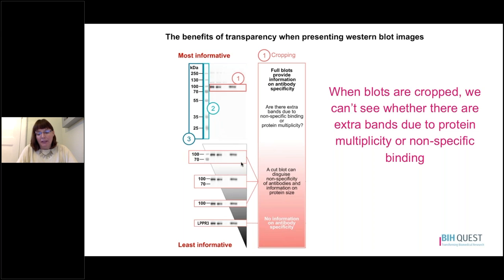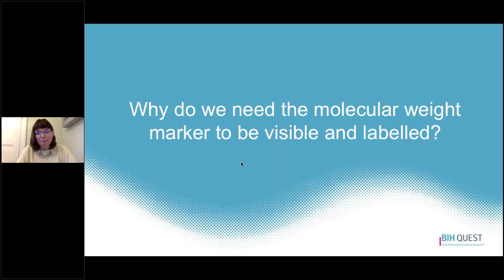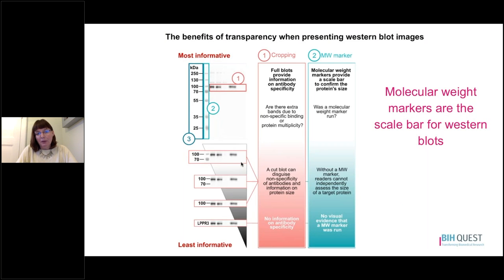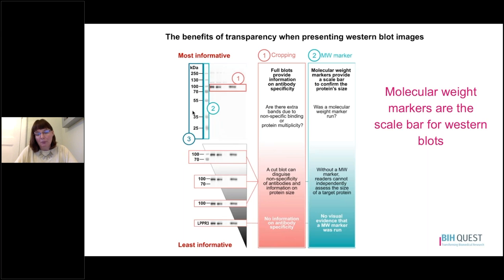Why do we need the molecular weight marker to be visible and labeled? When we run a western blot, part of the way we determine we have the right protein is by knowing it is the correct size, since western blotting separates proteins based on size. The molecular weight marker is essentially the scale bar for your blot — the same way you would have a scale on a graph with numbers so readers can tell where different data points fall. For the same reason, we need a molecular weight marker so we know the protein is roughly the size we would expect.